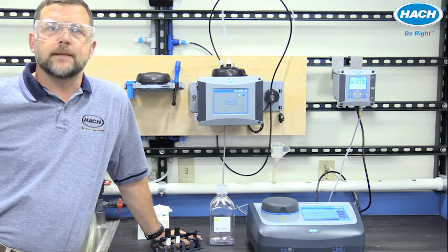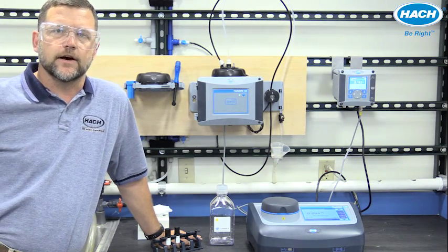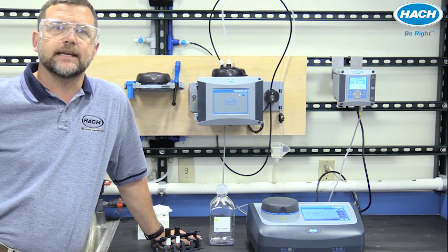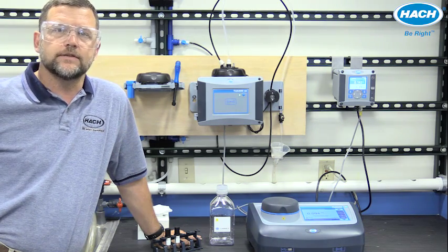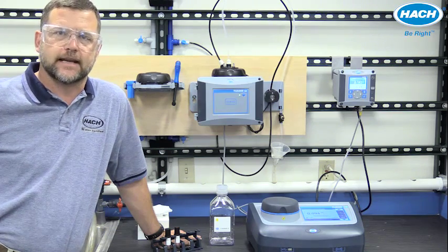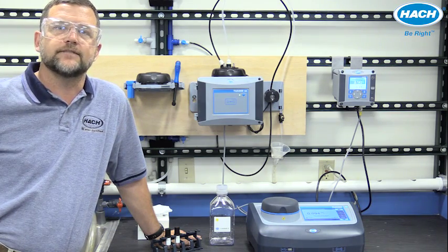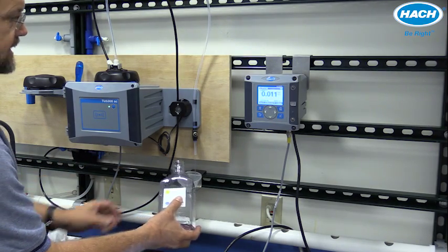Hi, I'm John Parsons with the Hach Technical Training Center. In this video, I'll demonstrate how easy it is to match lab and online results using the groundbreaking 360 by 90 detection technology of the TU5 series turbidimeters. Collect a sample from the process turbidimeter using a clean container.